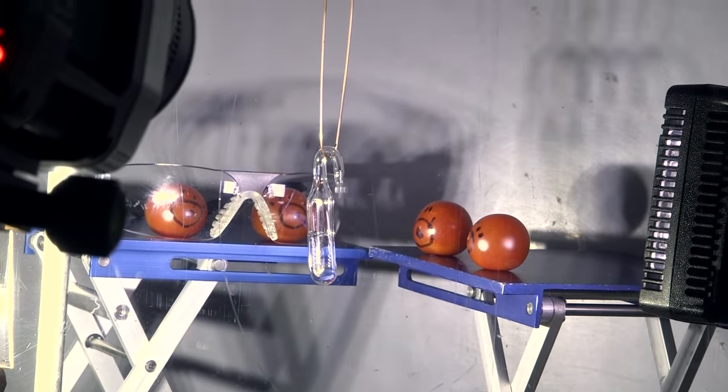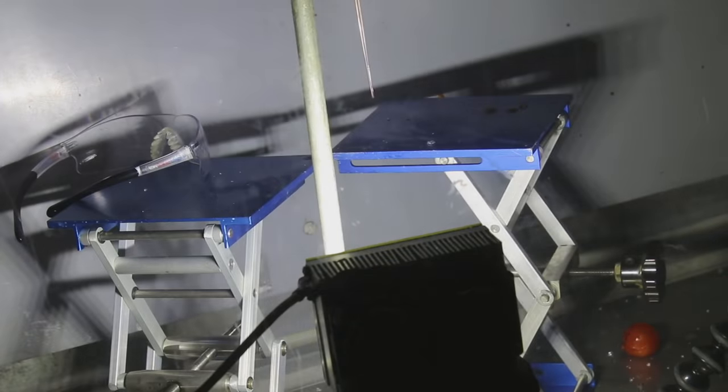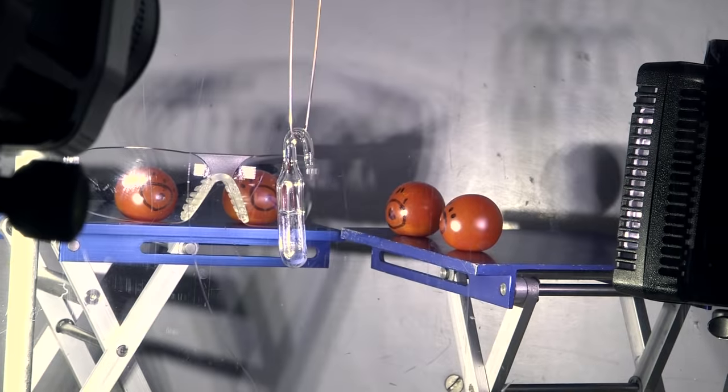As you heat it, the water begins to boil and turns into steam. The volume of steam is much bigger than the volume of water, so the pressure goes up and up and can reach several hundred atmospheres if the glass is really strong. Then suddenly it explodes, and pieces of glass fly everywhere.